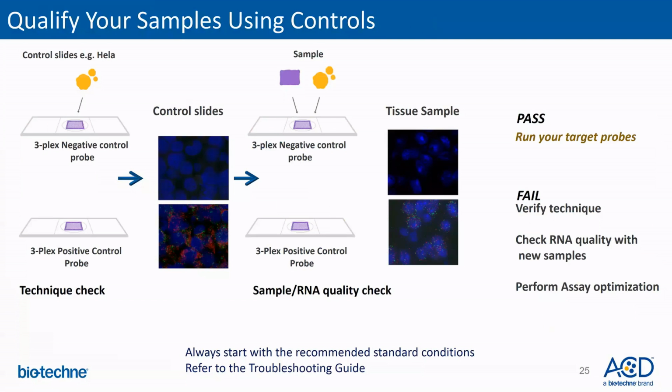Once the technique and the sample or RNA quality check has passed, you can run your target probes. If it fails, we recommend that you first verify the technique, check RNA quality using new samples, and perform assay optimization if necessary.